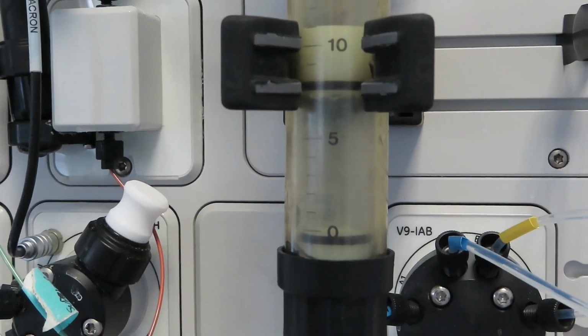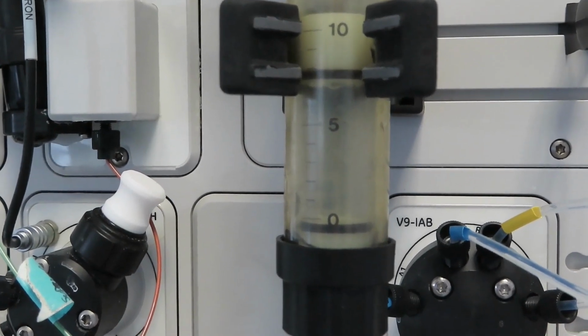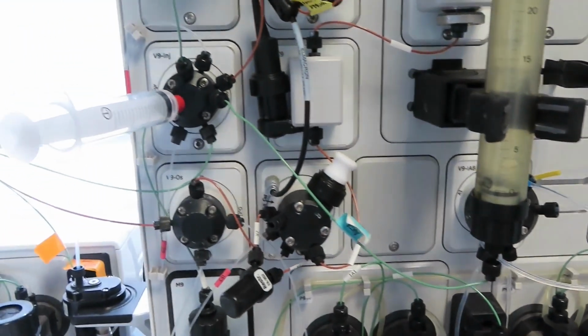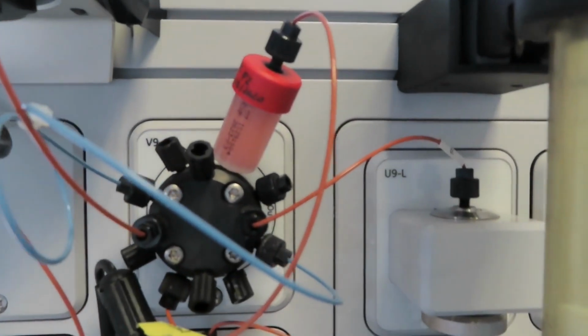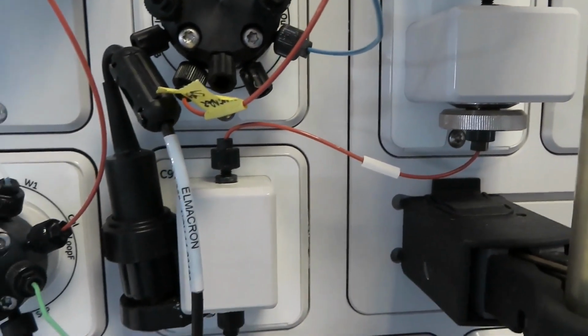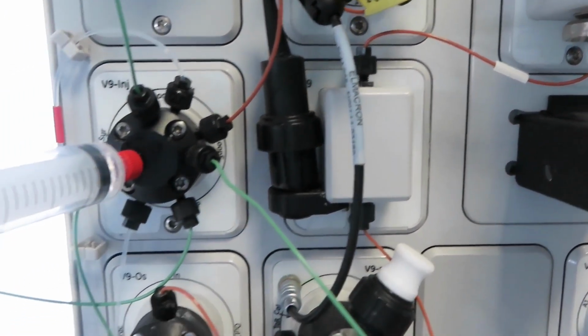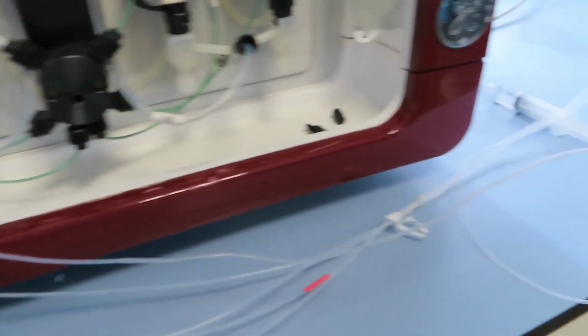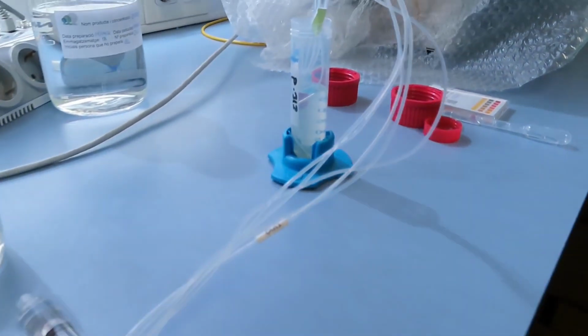The injection of the sample to the column starts. From this moment, all the process is automated through a programmed method. The plunger descends to inject the whole sample into the column. Proteins with affinity bind to the resin, whereas the rest of the proteins pass through the column and are detected by their absorbance in the ultraviolet range. The sample that doesn't bind to the resin, called flow-through, is collected in a tube in order to be able to recover the protein of interest in case it hasn't bound to the column.